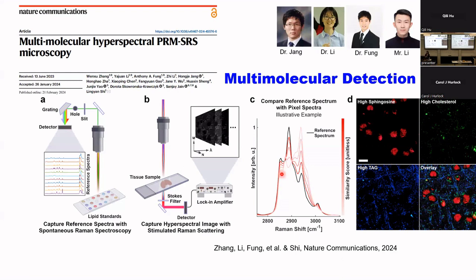So each pixel you have that spectral information, and you know on that particular pixel there are many different types of molecules sitting there, but it cannot be unlimited. It is finite, and the concentration of these molecules can be very different. For example, for pixel number 1, perhaps you can detect the top five molecules with high concentration, but the other molecules are perhaps below the detection limit, so you can just ignore them. So the top concentration molecules can actually be measured by the reference matching with penalty algorithm.